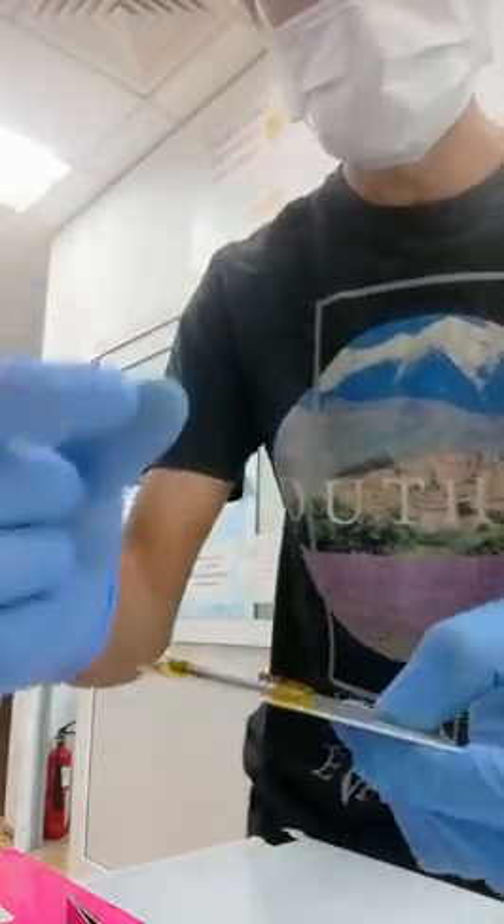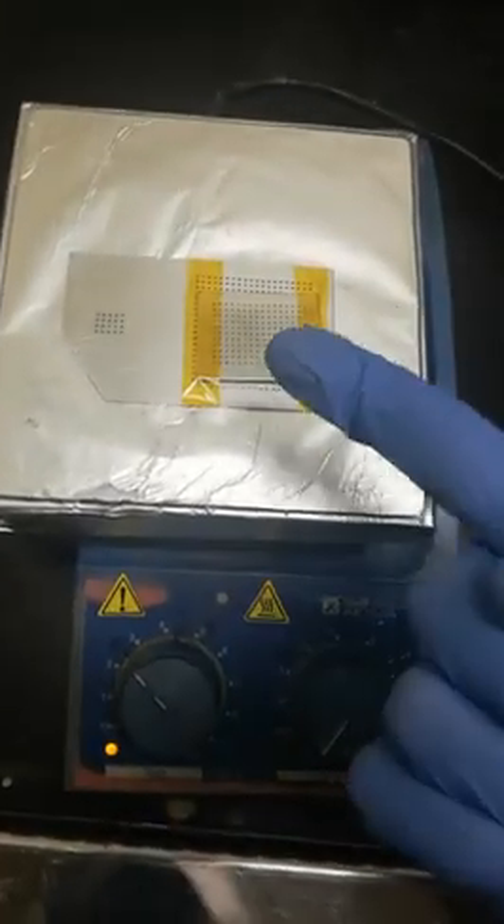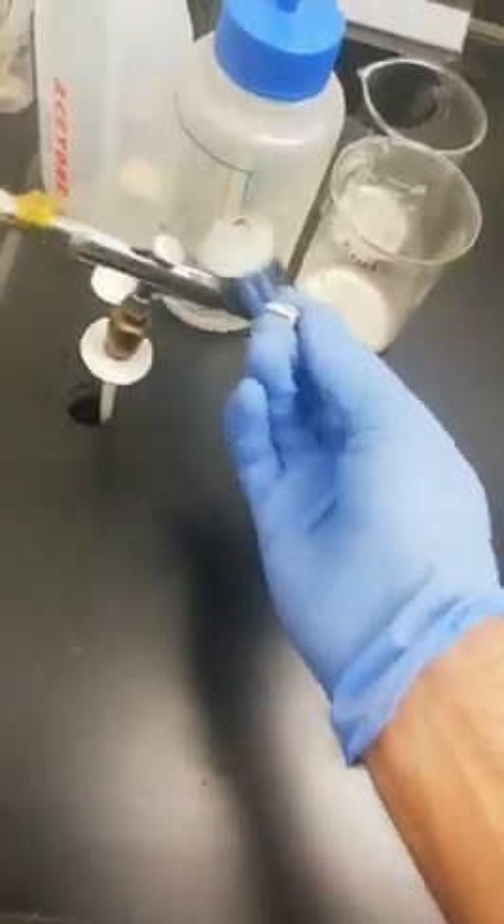Your sample is in between these two masks. You have to put your sample on the hot plate, and then you have to fill these silver nanowires into your brush.